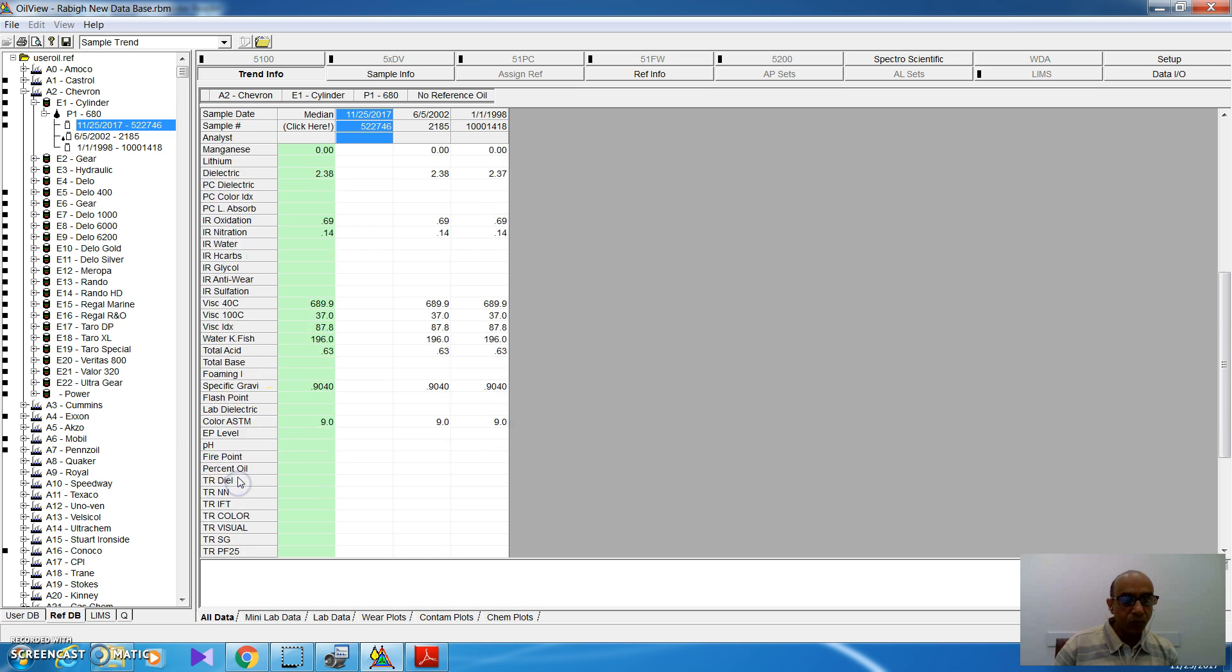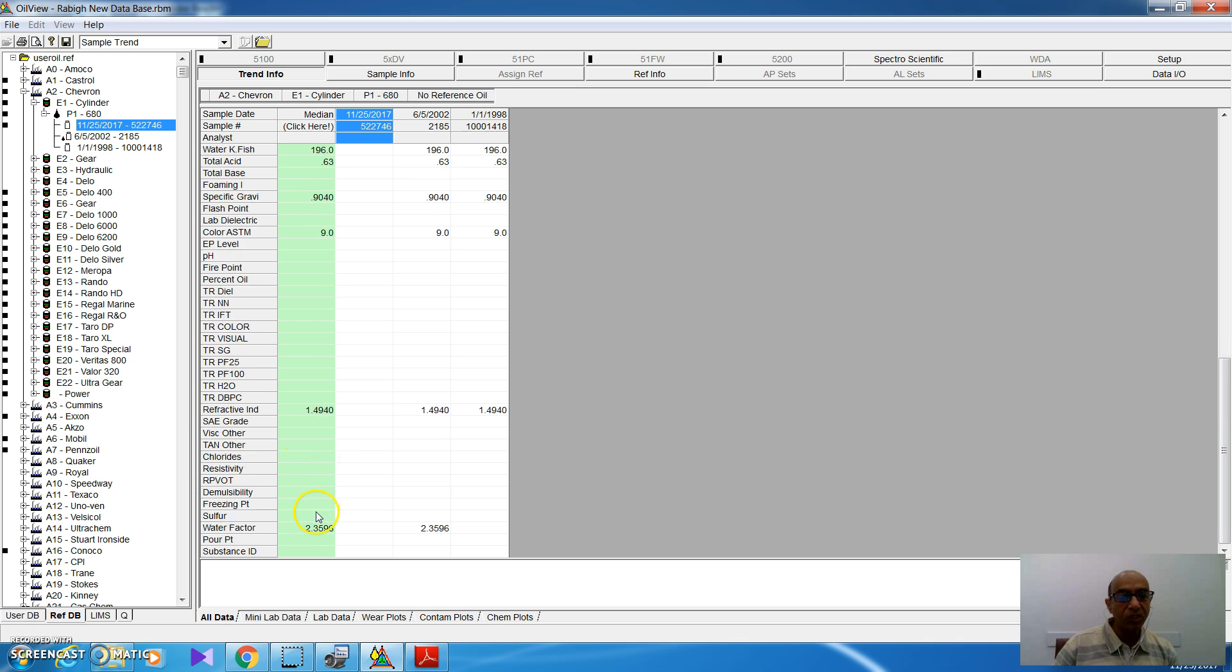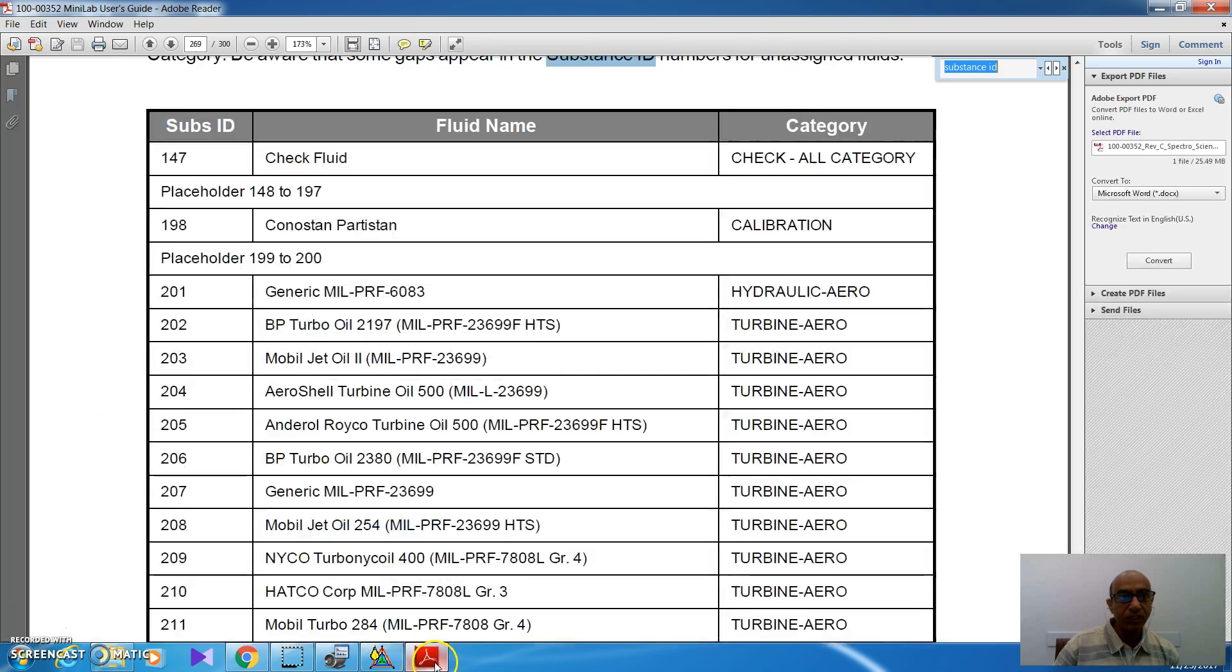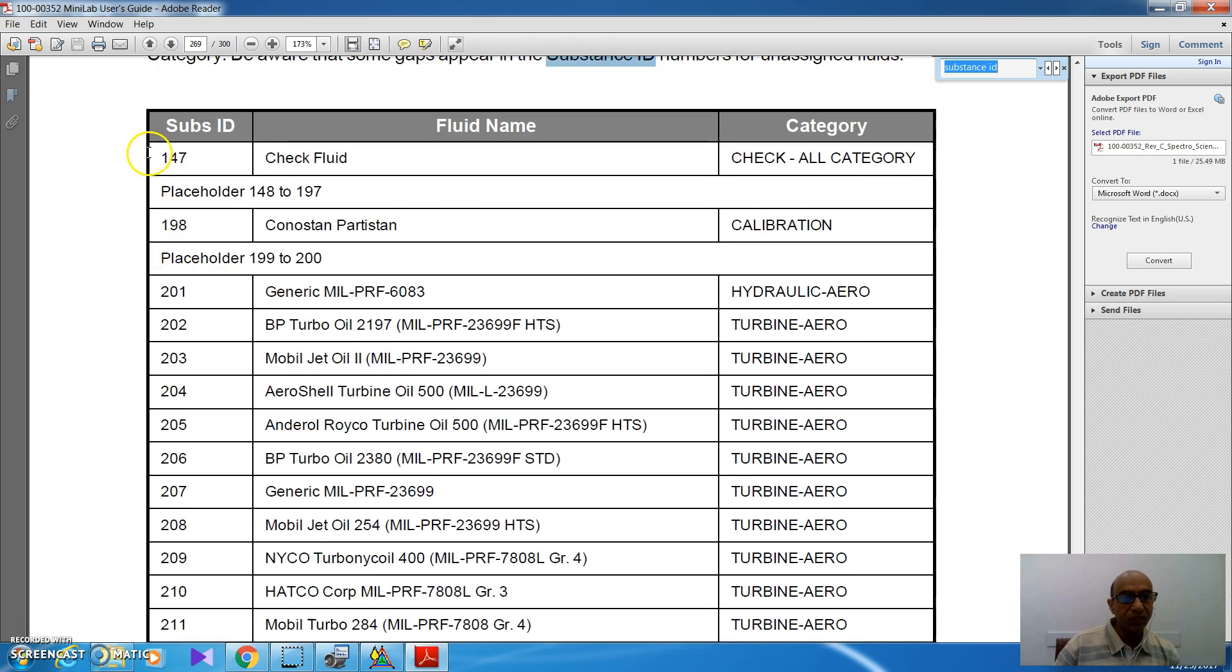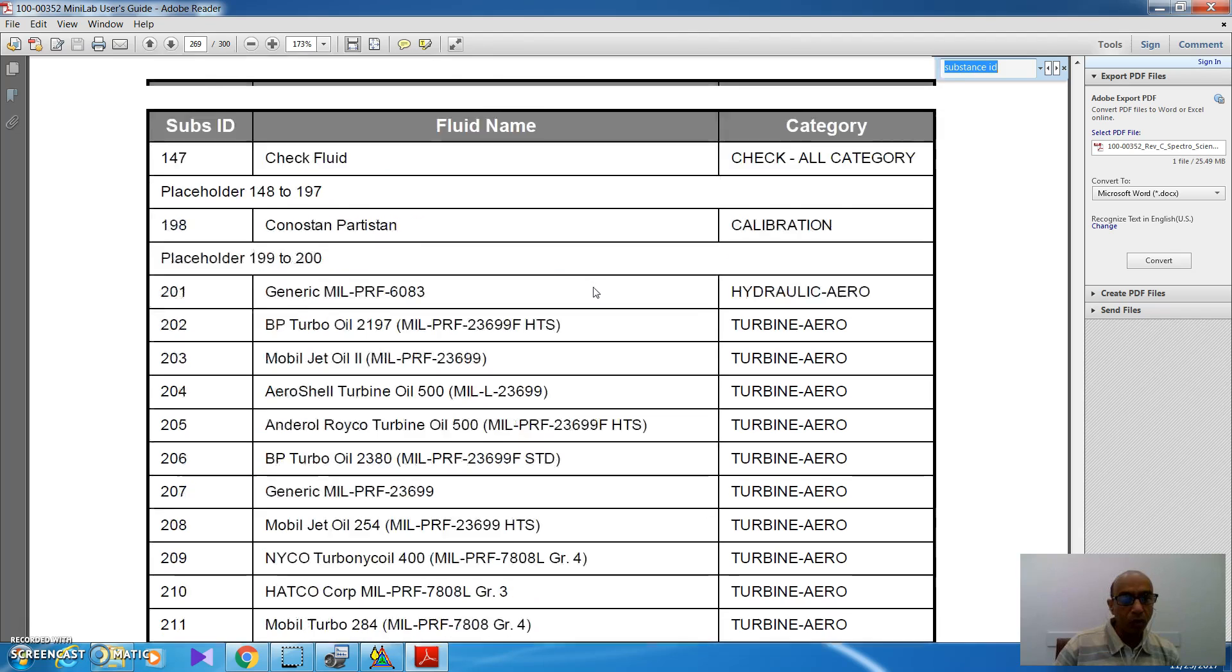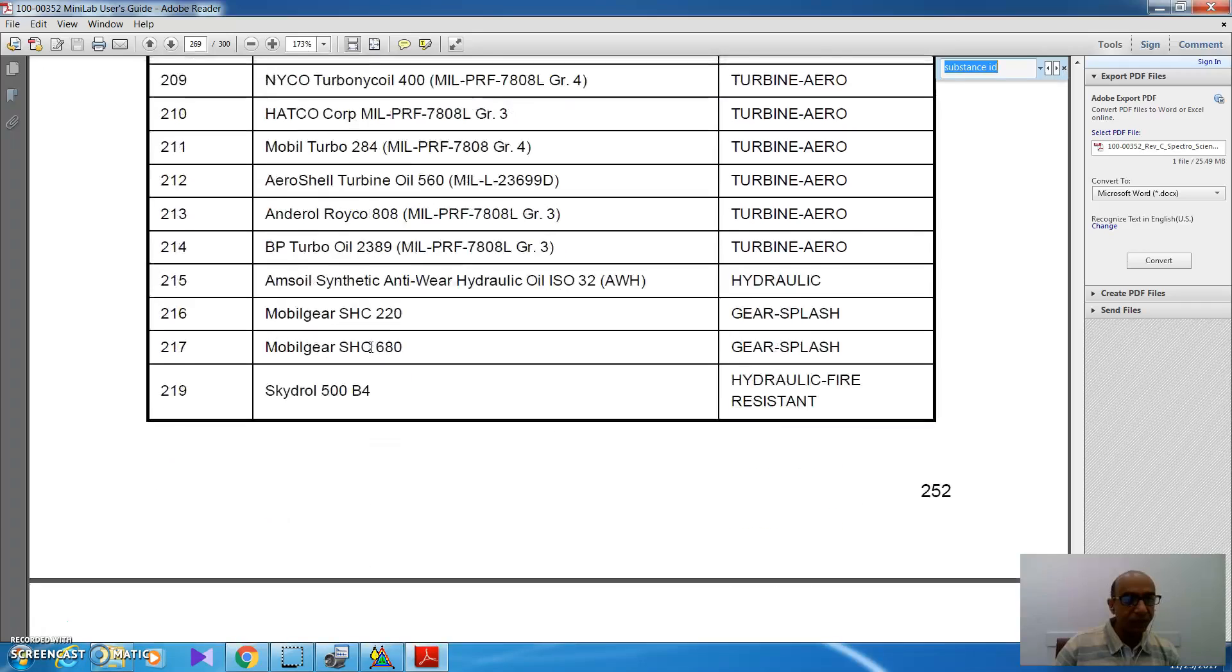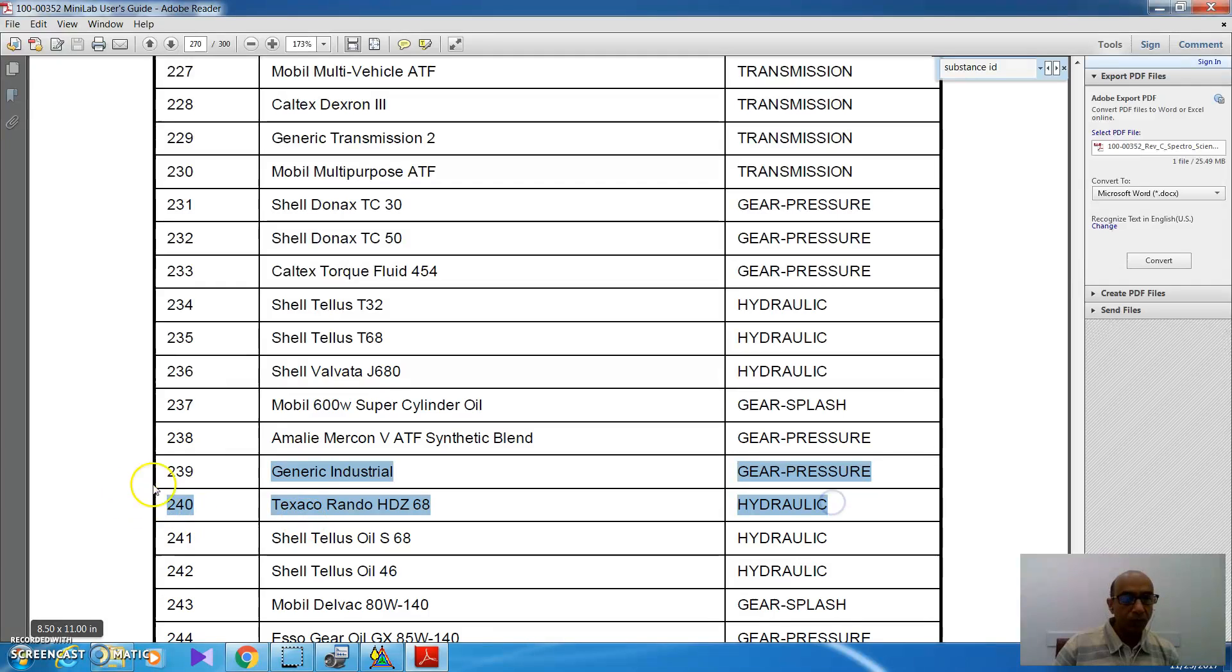So, unless the viscosity index is mentioned in the reference sample, I will not expect to get the measurement of viscosity at 100 degree. Also, there are a lot of parameters here, for example, refractive index, which is mentioned here. Here is the water factor. Here is the substance ID. Substance ID is not mentioned here. So, I have to put it manually. In some oil, I will find the substance ID written, but in other reference oil, I will not. So, to find that, I have to go to the manual of Minilab, this manual, Minilab user, and I will find this table. In this table, I found it in page 269. From this table, I can look for any oil, then get the substance ID.